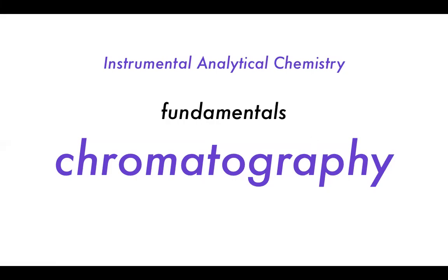Hello and welcome to this session on the fundamentals of chromatography, where we will be describing the general processes involved with chromatographic analysis, which is specifically important to your instrumental and analytical chemistry needs. We won't really be covering any specific techniques such as HPLC or gas chromatography in this session, but we will be talking about general principles involved, including peak resolution and the various techniques which can be used to improve the quality of our chromatograph.